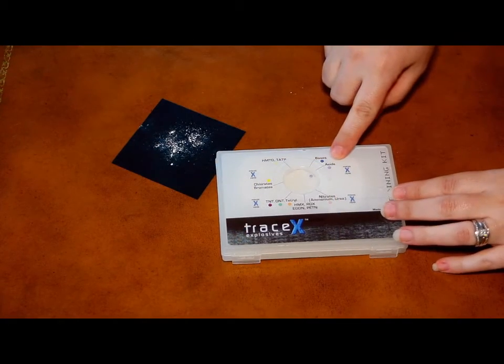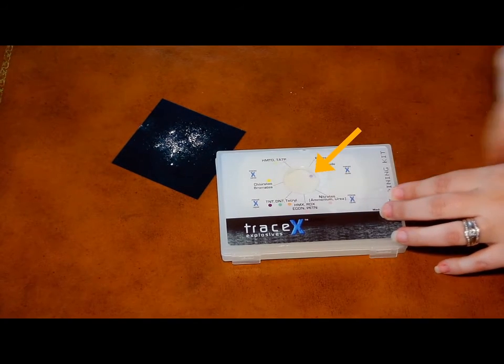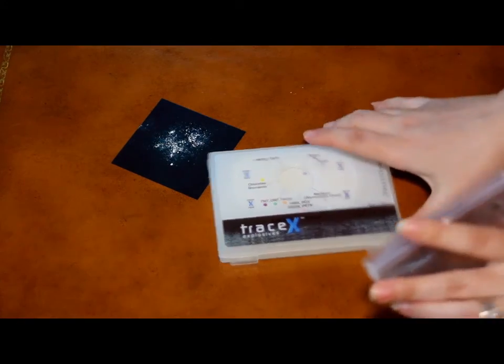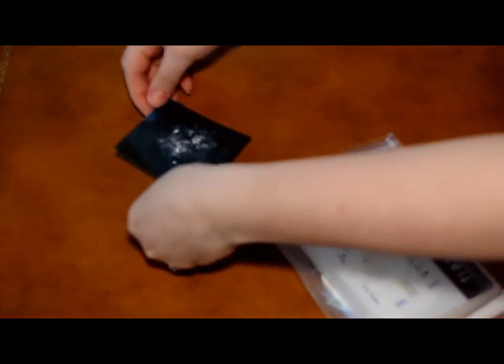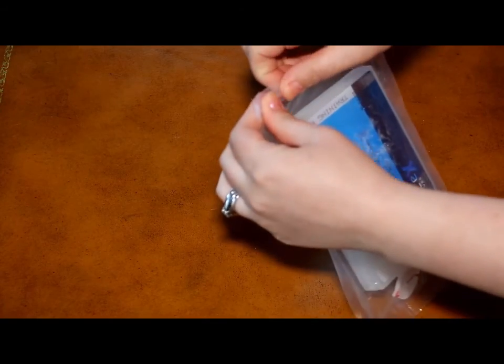Look through the kit window for color change. As you can see on my kit, a purple color has formed indicating an acid. After 10 minutes have gone by, you can disregard any additional color changes. You're done. Now you can dispose of the kit by placing it in the plastic storage bag. Make sure to dispose of the kit — reusing or repurposing the kit will give you inaccurate results.